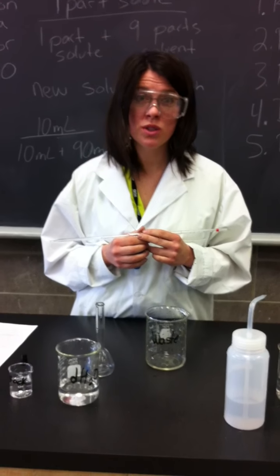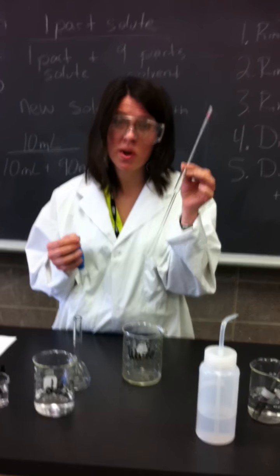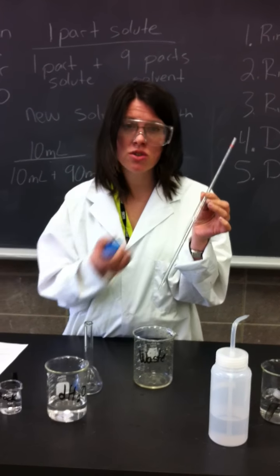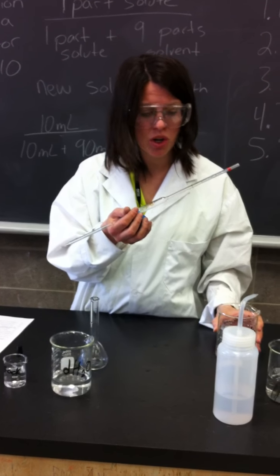I'm going to show you a little bit about how to dilute an acid today. So first of all, we've got this pipette. We don't know where it's been, so we want to make sure that it's clean. So we're going to season the pipette. First of all, we're going to clean it, and then we're going to season it.